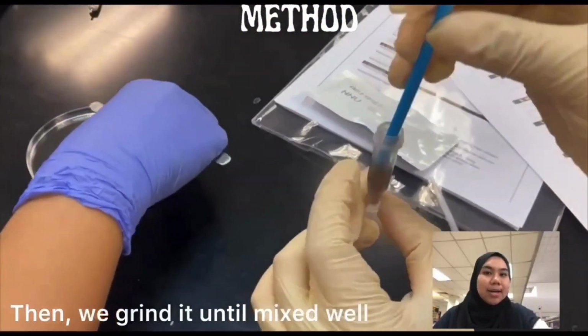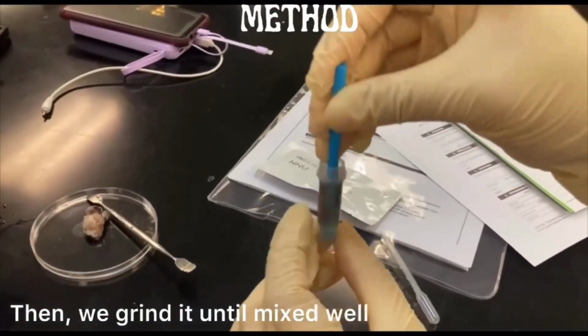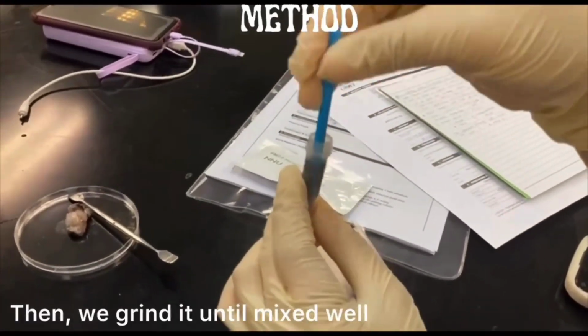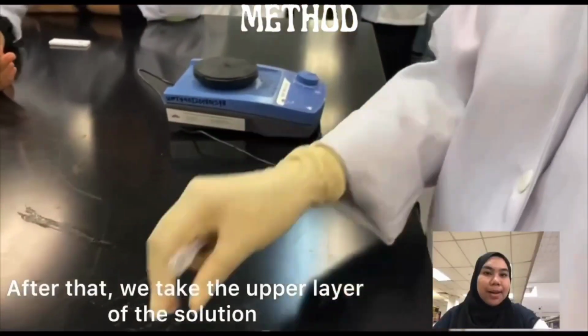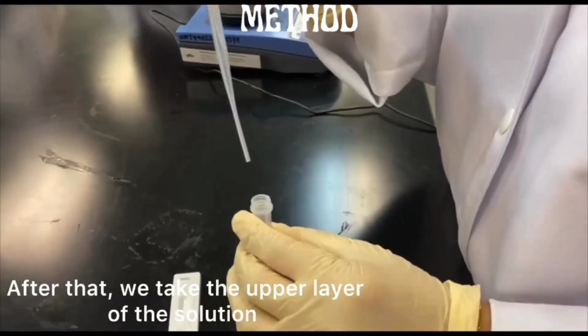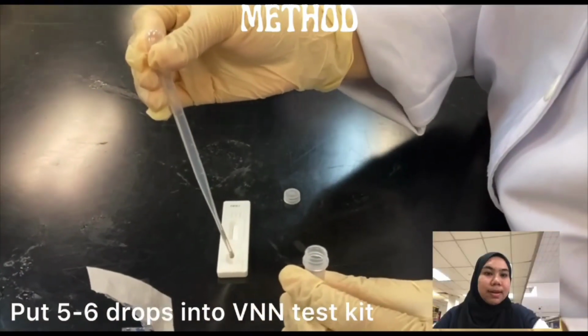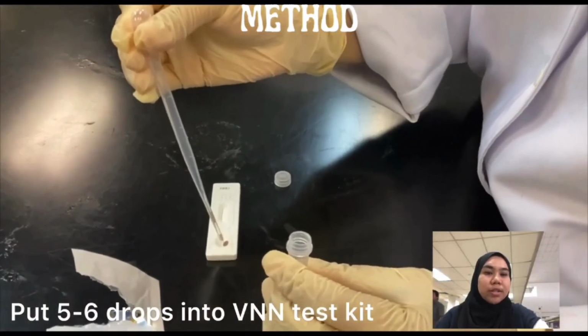Then we grind it until mixed well. After that, we take the upper layer of the solution. Put 5 to 6 drops into the viral nervous necrosis test kit.